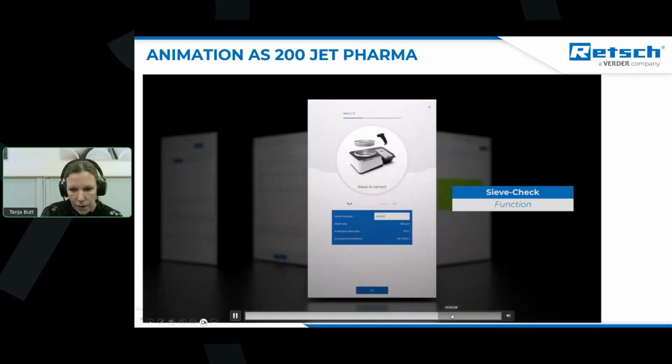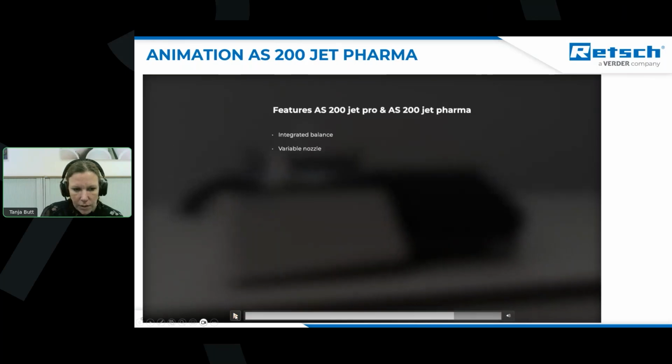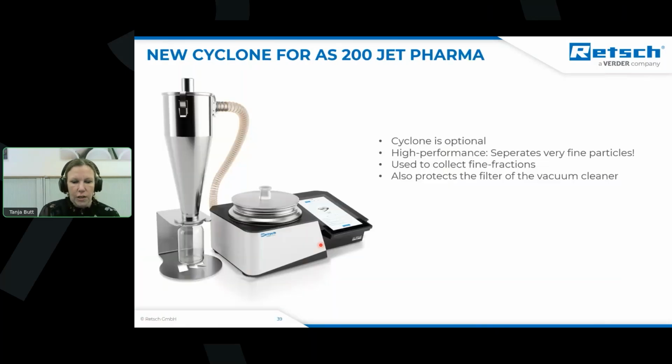Okay, I think I can skip this. You will get this video also in the download package. So please make sure to use the download package in order to get all the information. Here again, the cyclone, which helps to use the fine fraction if you like.